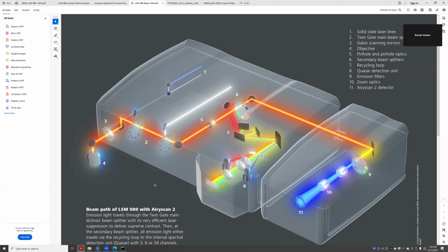There's two of them because there's one separate for 405. And if you would have two photon, that's where two photon wavelengths would come in. So that's called invis because they're outside of the visible spectrum, where all the visible lines come in on that other wheel. So that's why you see two MBS options.